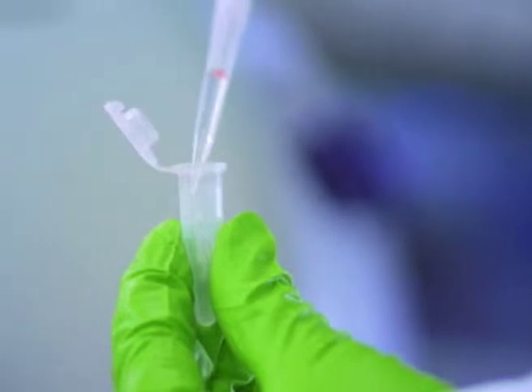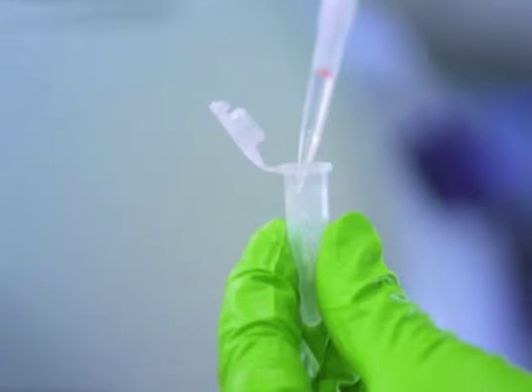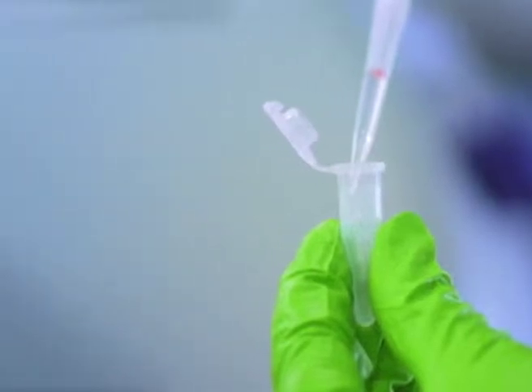Reactions such as softening, swelling, curling, color changes are some features which are to be noted properly. Entire layers may dissolve or disaggregate, pigment fillers may bubble or fizz or flake apart, called flocculation. Apparent color change may be seen in some layers. These tests are not clear-cut results that are easily quantified. These results are then primarily used for preliminary classification and comparison.